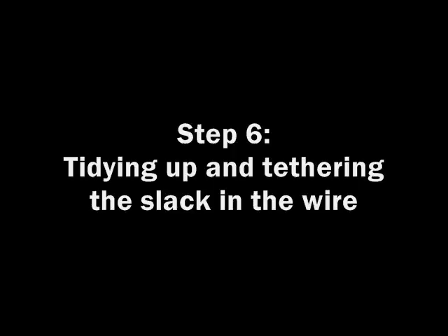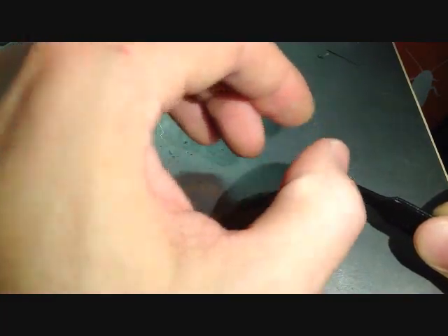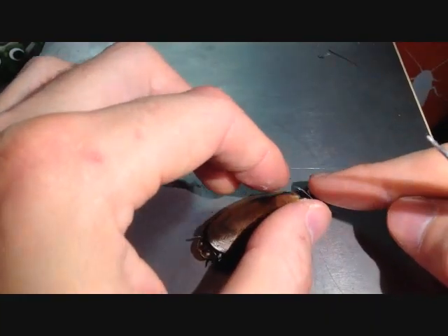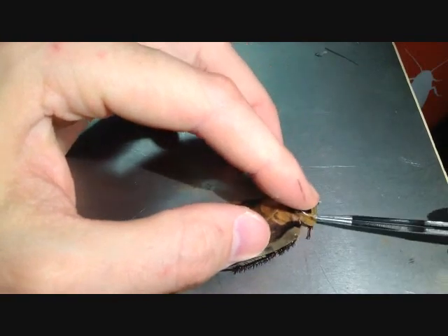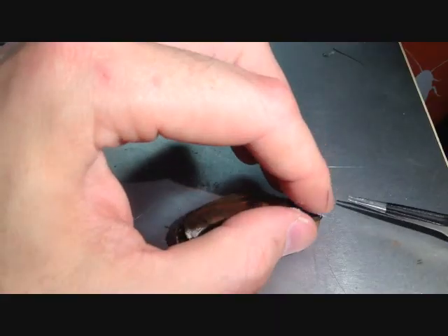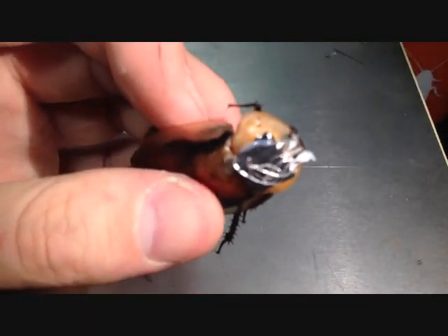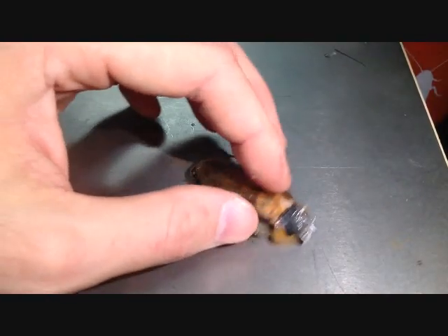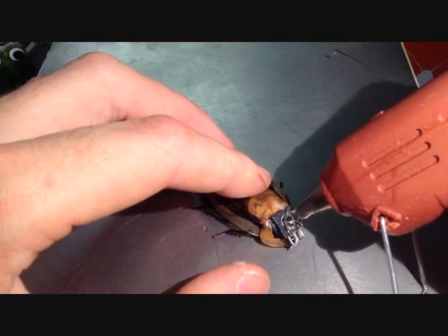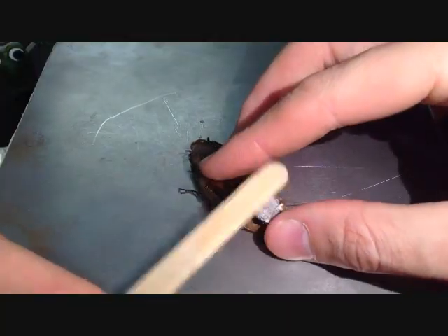For the last step of the surgery, you need to tidy the slack in the wire and tether it down. If we don't do this, the wires could easily get snagged and pull out the electrodes. Using your fingers or forceps, carefully organize the wire slack on top of the connector — try to ensure as little slack wire exists between the antenna and the connector. If anything does accidentally come loose, refer to the failures and fixes section of the Neural Interfaces experiment. Now prepare the end of a small flat surface such as a popsicle stick by wetting it and then dipping it in the flour. Then use your hot glue gun and place a dab of hot glue on top of the wires. Quickly after applying the hot glue, use your floured flat edge and smoosh down the hot glue. The purpose of the flour is to prevent the hot glue from sticking to your smooshing tool.